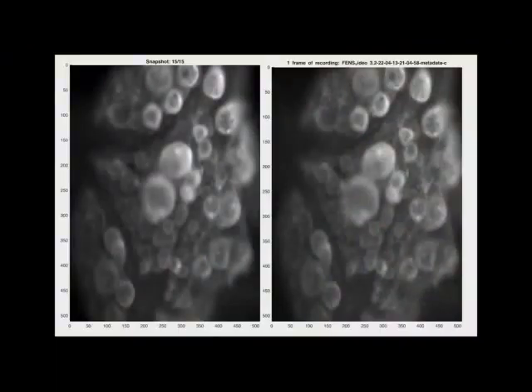But what results do we get from the recording? Here you can see two images of the ganglion taken by the camera in the setup. On the left side you can see the snapshot that was taken in the beginning, right before the recording started. On the right side you can see the first frame of the recording. In both you can see very well each individual cell body in the ganglion. And when you look now on the right side and we go through all the frames of the recording, you can see by the flickering of the ganglion that there are cells active and that the network is responding to the stimulation that we're giving.